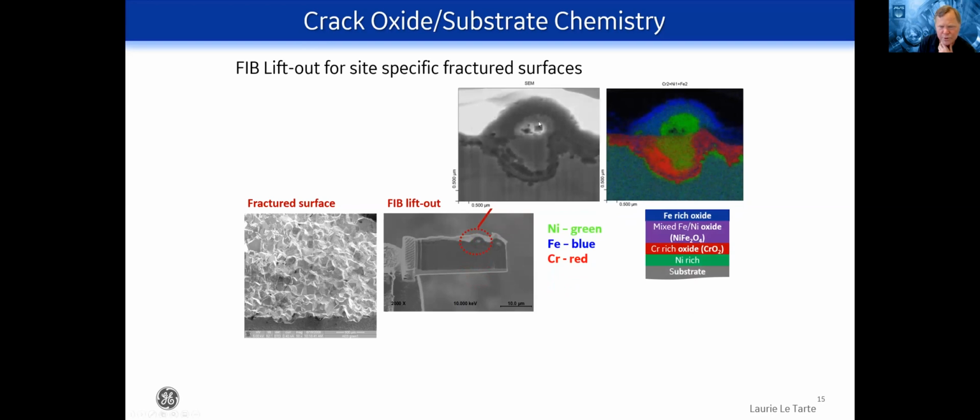Within the Auger instrument, we collect the secondary electron image, and we also collect the chemical information. Right away, we see that there are a number of different species distributed through this region of the sample. That information would be hard to gather through other techniques or other perturbations.